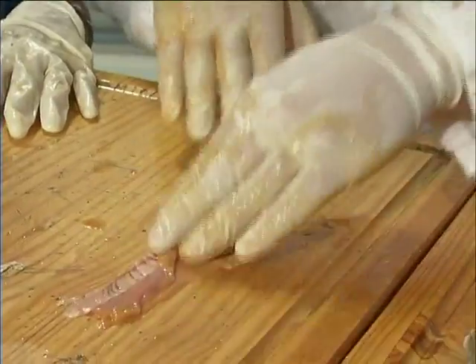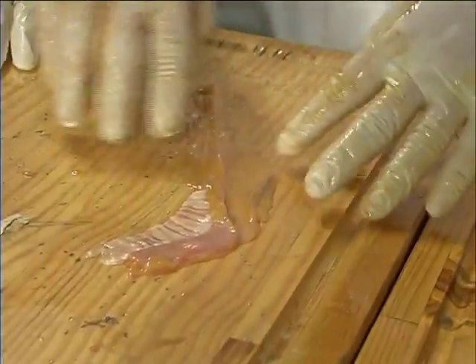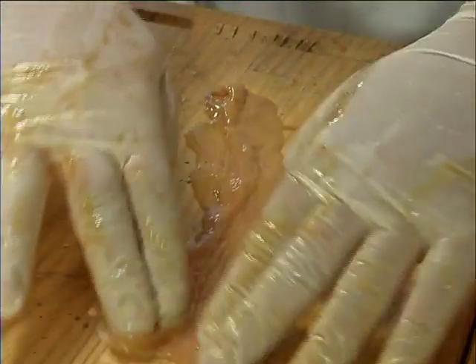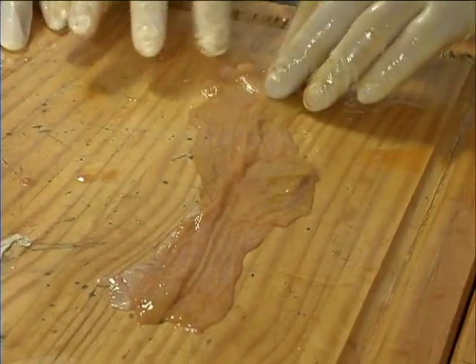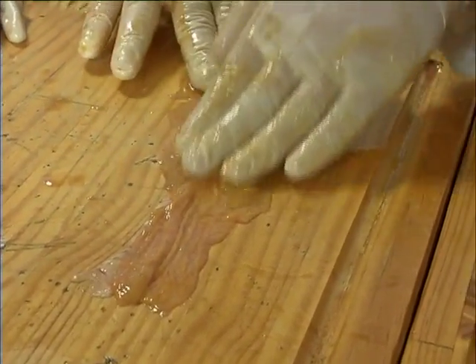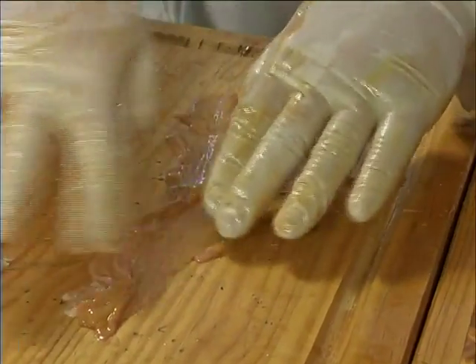Cool. If you have a look, it's still got the blood vessels running through there, right? It's nice and pink on the inside. It's got a covering on the inside. Remember, it's got that lining, same as the stomach almost, to protect it. It's very important to protect this, because if this goes, we're in trouble.